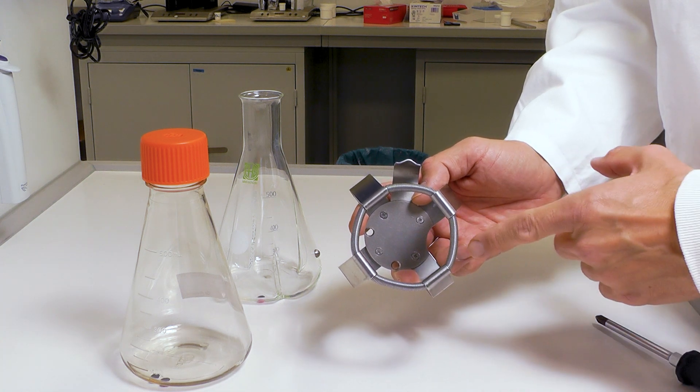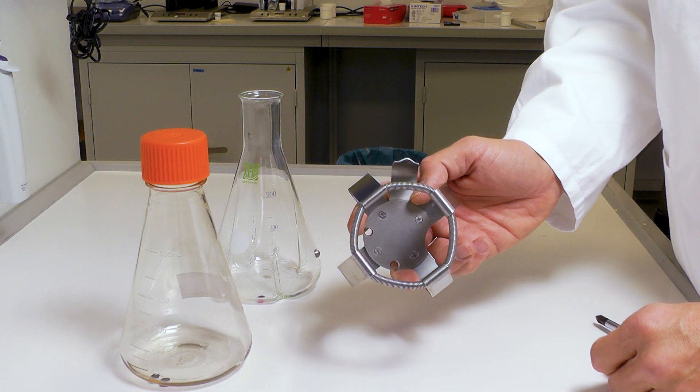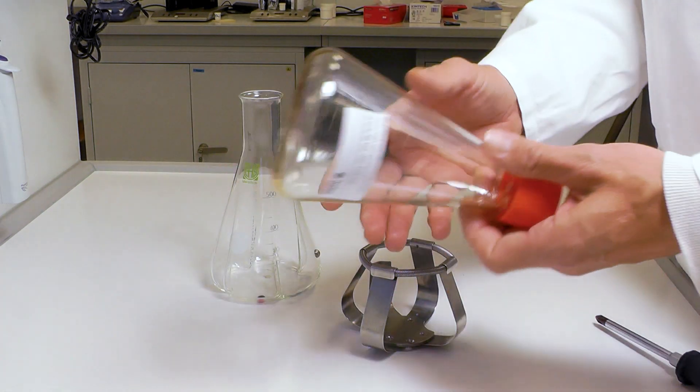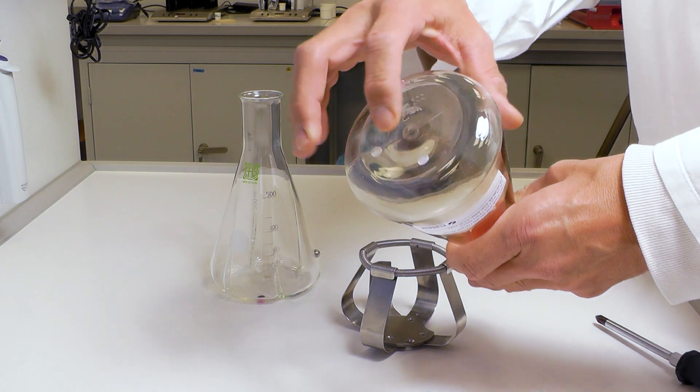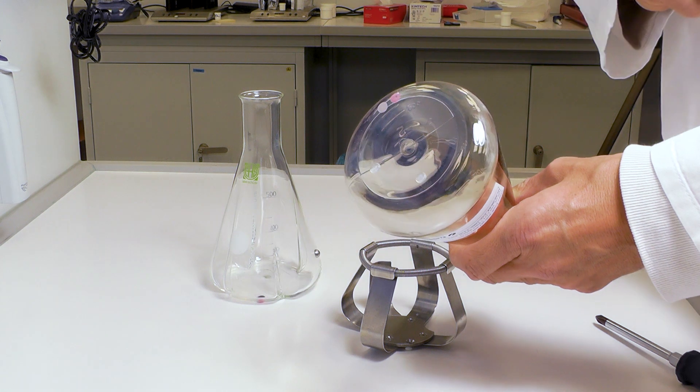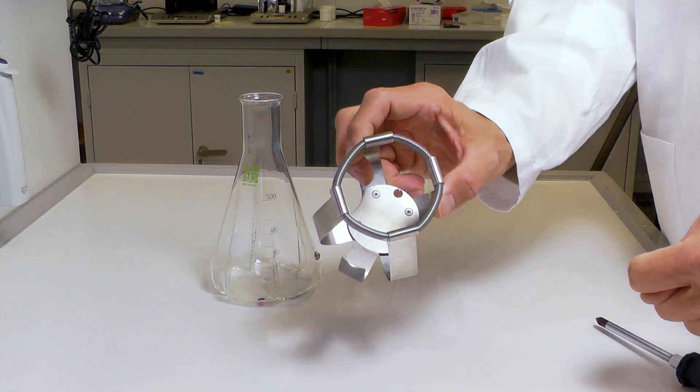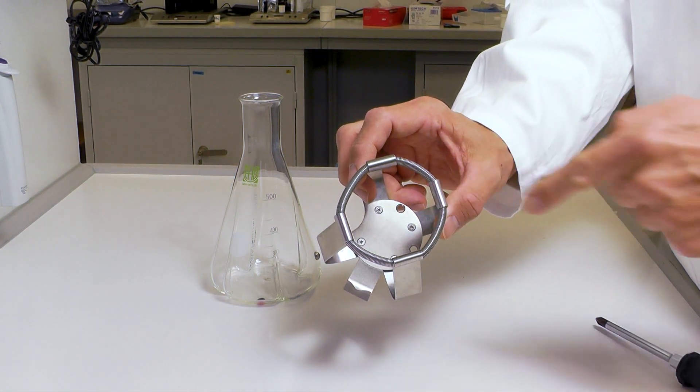There are two holes in the clamp base plate to hold the two knobs on the plastic sensor flask bottom. Glass flasks are aligned using a sideways arm.